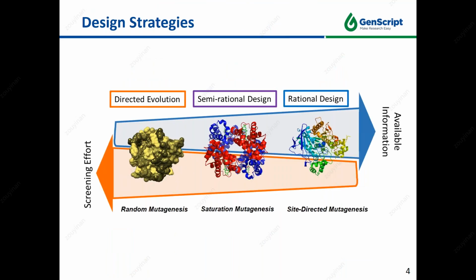This is an interesting figure demonstrating the level of background knowledge of the protein of interest and the screening effort needed for different design strategies. Usually, the more knowledge we acquire about a target, the less effort will be needed for screening. A semi-rational design provides less pressure for screening to our customers. The users do not need comprehensive knowledge about a target either.